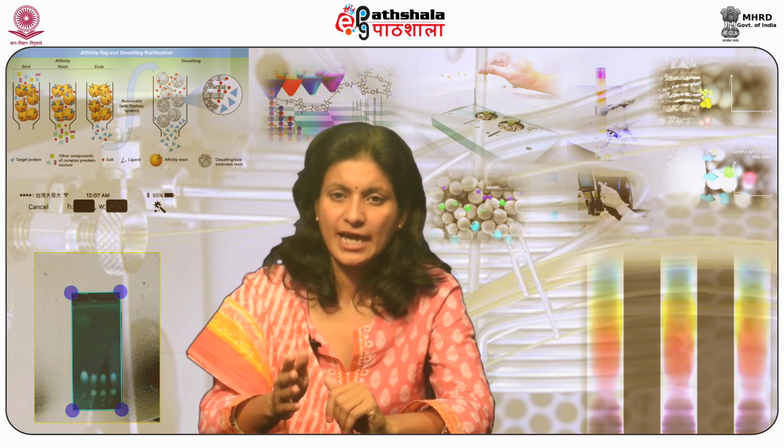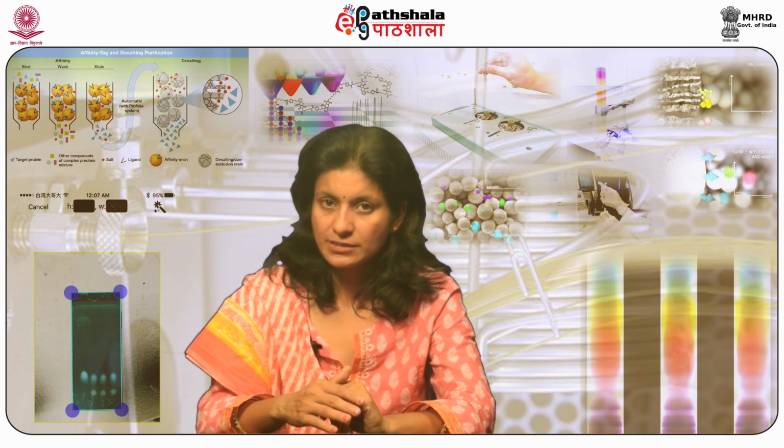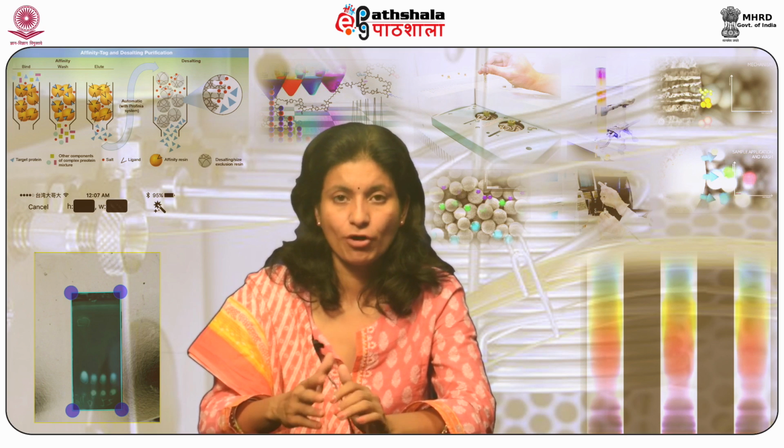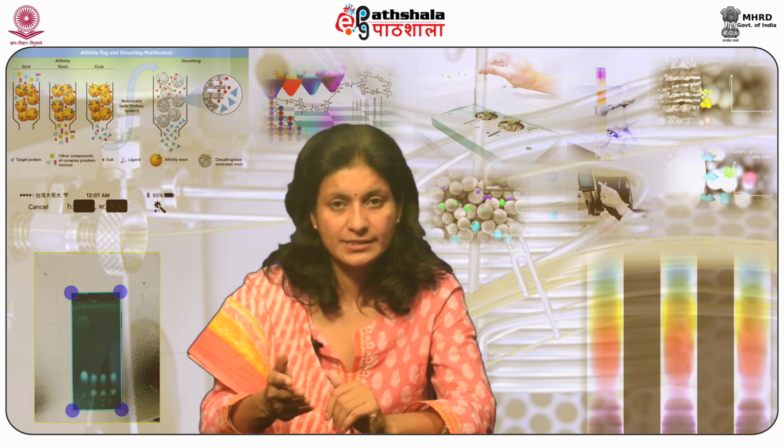A similar technique can be utilized for fluoride and sulfide in solid samples. Acid digestion is best for the preparation of samples which are to be evaluated for cations utilizing the IEC technique.